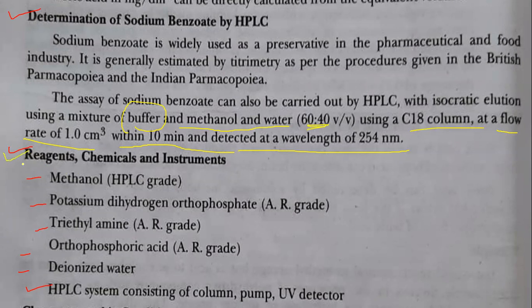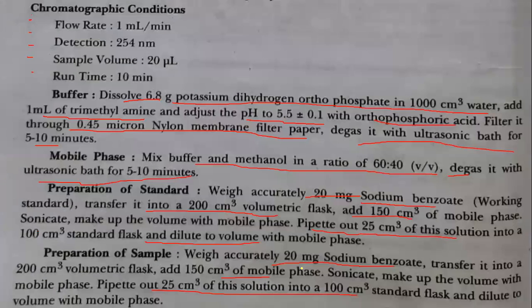So the reagents, chemicals and instruments: we are using methanol, potassium dihydrogen orthophosphate, triethylamine, orthophosphoric acid, deionized water, and an HPLC system consisting of a C18 column, pump, UV detector. Okay, so chromatographic condition, flow rate हा 1 ml per minute मेंटेन करायचा आहे. जे आपण अगोदर शिकलो ना जीसी मध्ये, त्या पद्धतीने HPLC असतो. आणि HPLC मला वाटतं त्या ठिकाणी that is also very familiar to you, that I have already explained to you.